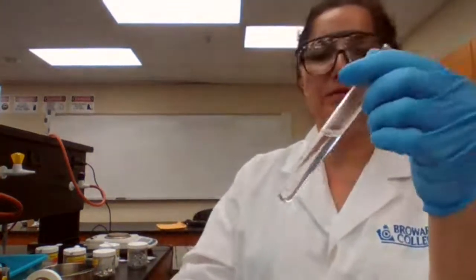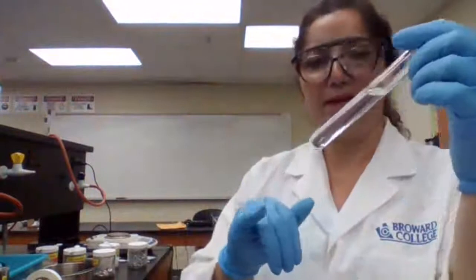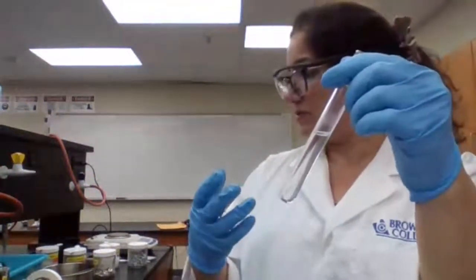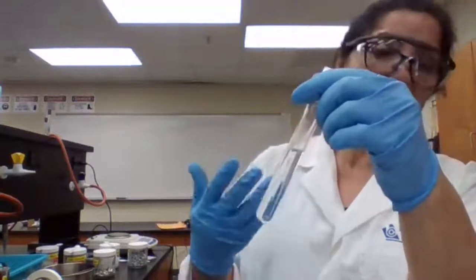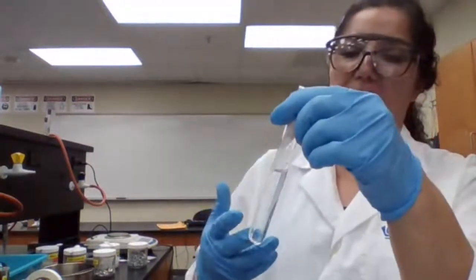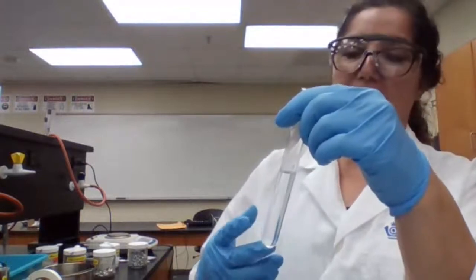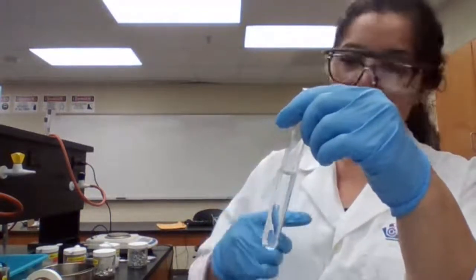Okay, my test solution for oxalic acid and permanganate showed no evidence for any reaction. I assume that the permanganate has been left for long outside, so I have to make a fresh solution of permanganate and continue the other part of the experiment.